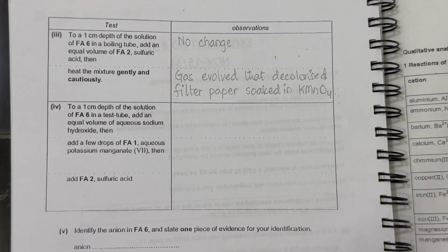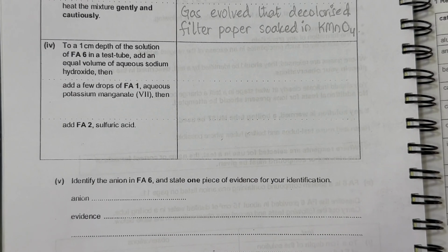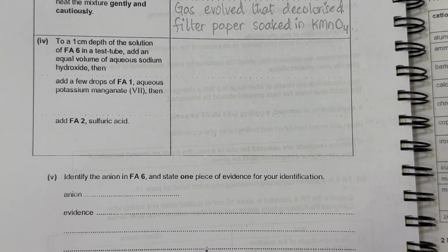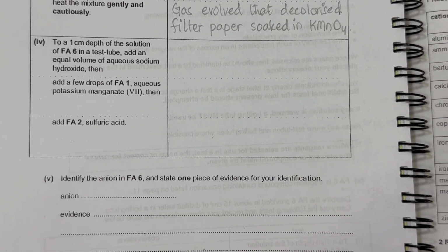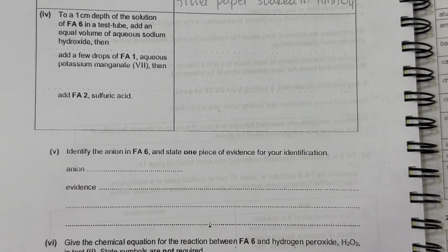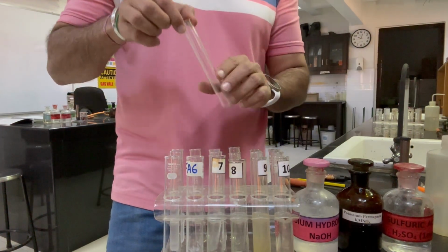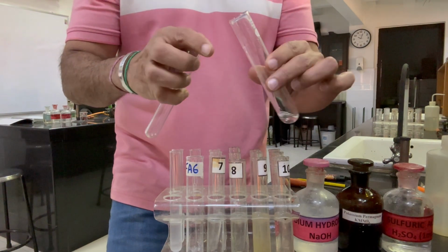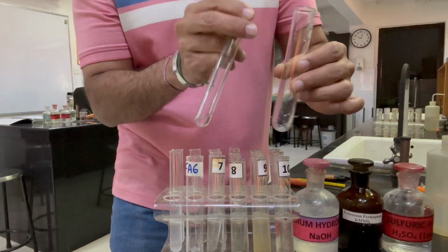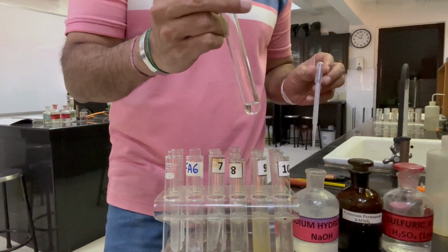And then let's move on to the next part, where they say to a 1 centimeter depth of the solution of Fa6 in a test tube, add an equal volume of sodium hydroxide, then add a few drops of Fa1, which is aqueous potassium manganate(VII), and in the same test tube then add sulfuric acid. So let's perform this test now. Now we will take 1 centimeter depth of Fa6 solution, and we add an equal volume of aqueous sodium hydroxide.